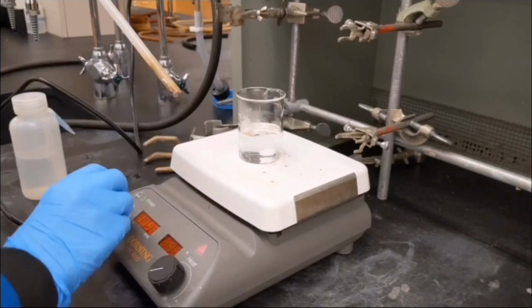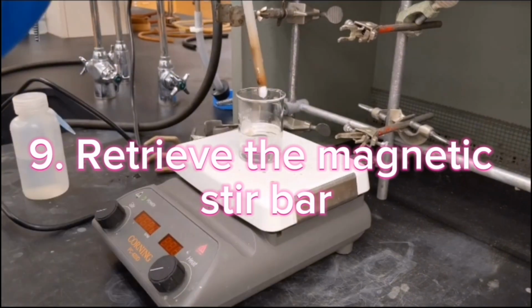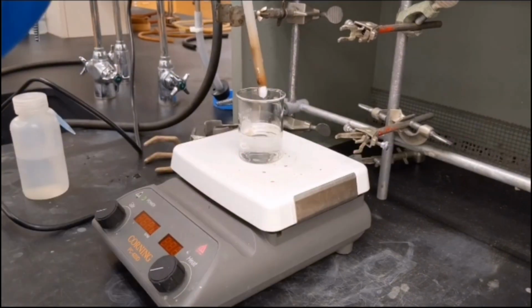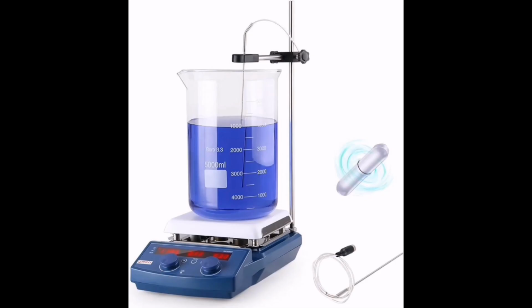After we reach the desired heat setting and stir setting, we need to retrieve the magnetic stirrer inside the flask or the vessel using the magnetic stir bar retriever. So, before that, we switch it off.